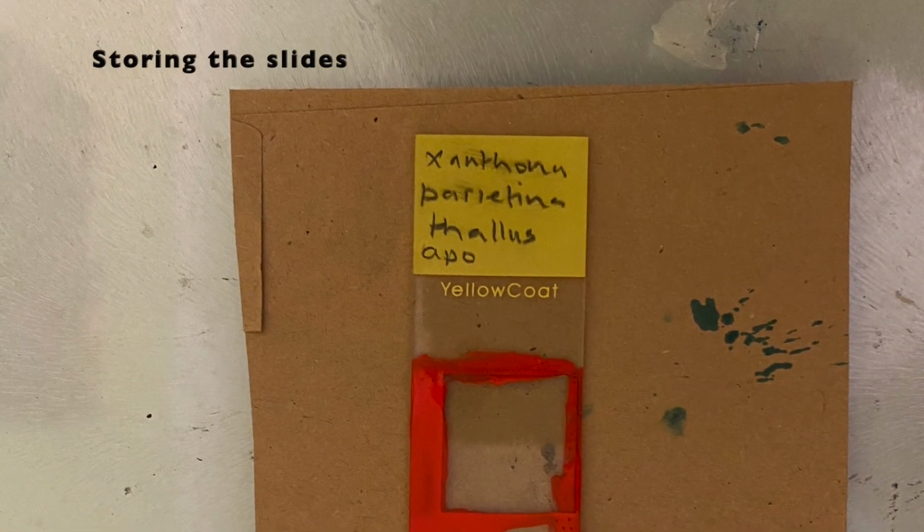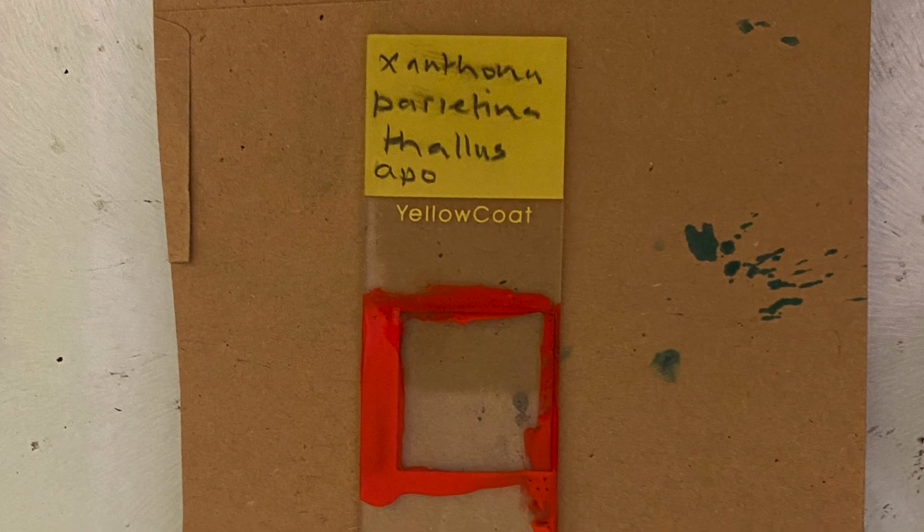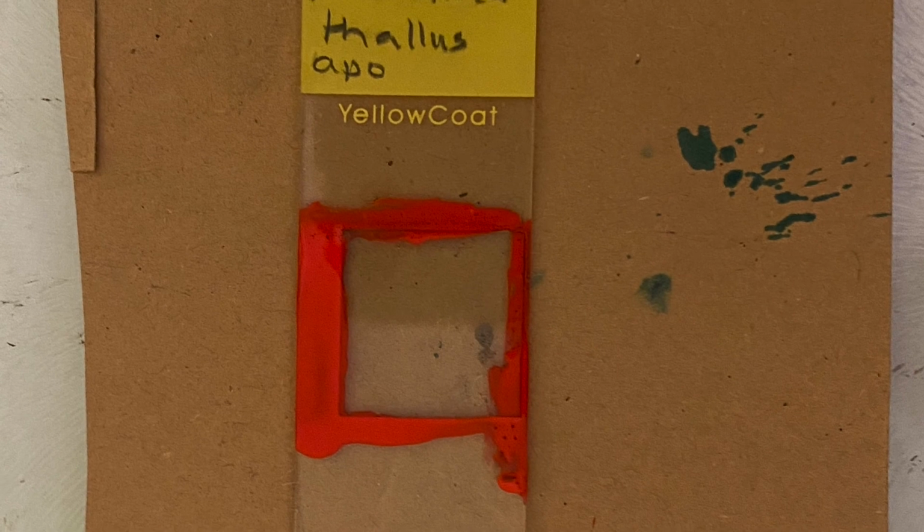Storing the slides. The slides will be perfectly fine for examination over at least 24 hours and probably more, but will eventually dry out.